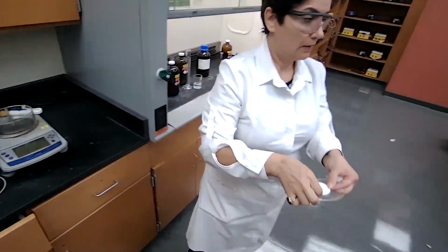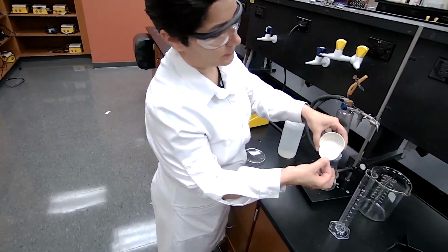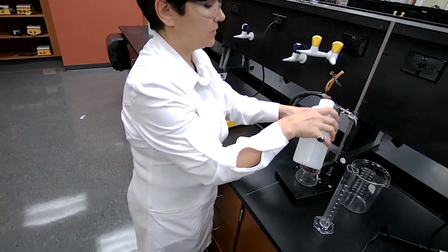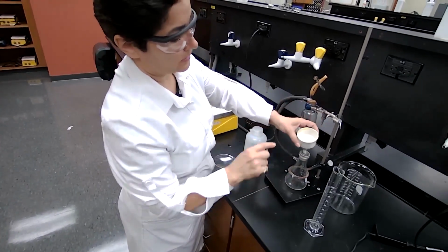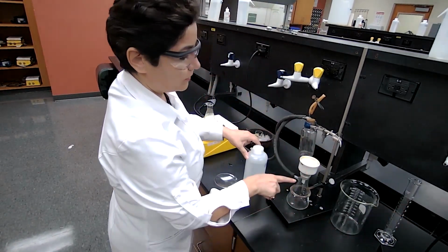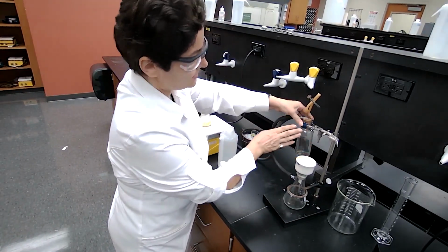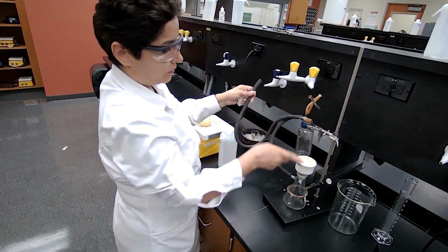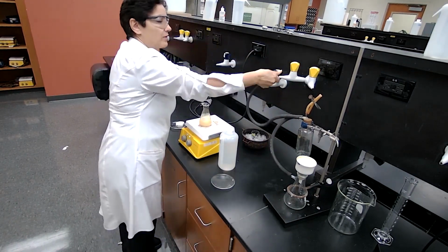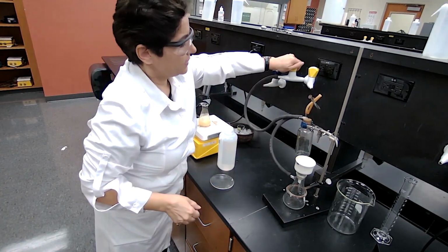And we place the filter paper inside the Buchner funnel to cover the openings of the Buchner funnel. We will add a few drops of water to make the paper stay still. Now, we are using a vacuum flask attached to a trap. As I have said in the past, the trap is needed here to avoid any water going into our vacuum system, because this is an electronic vacuum pump. And we connect, turn on the vacuum.